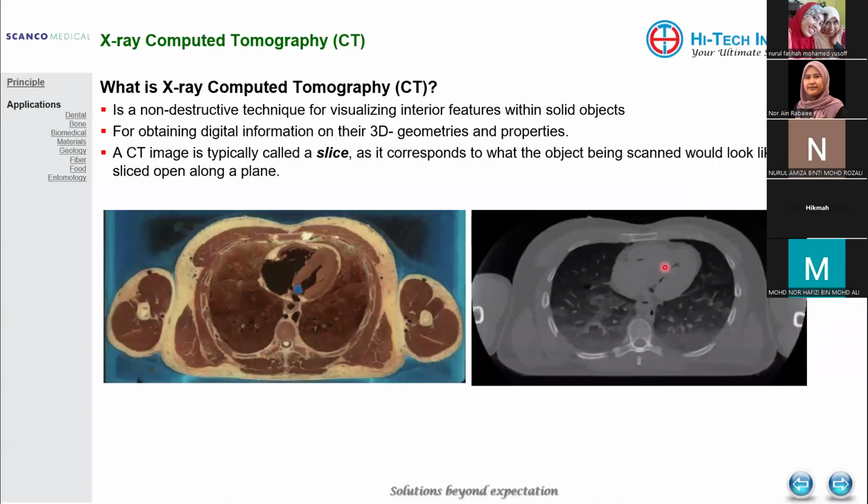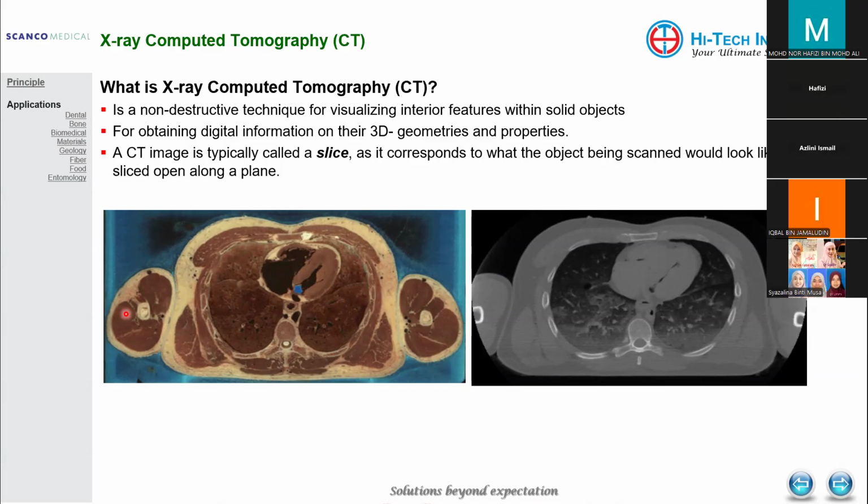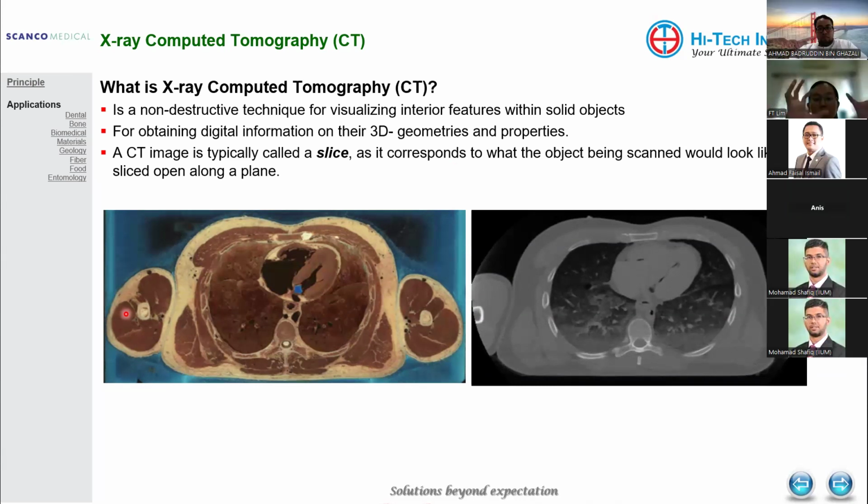So, after the reconstruction itself, what you can get is the 3D features. Together with all the fancy software today, you can study all the properties by looking at the 3D. You can look at the porosity out of a certain volume. You can look at the density out of a certain volume. So it can give you very accurate measurements and a lot of information out of the 3D features.